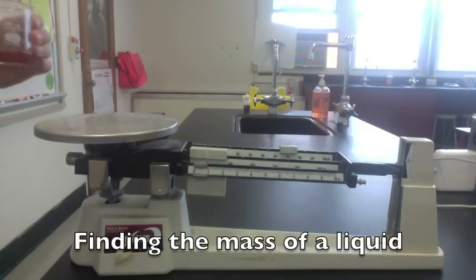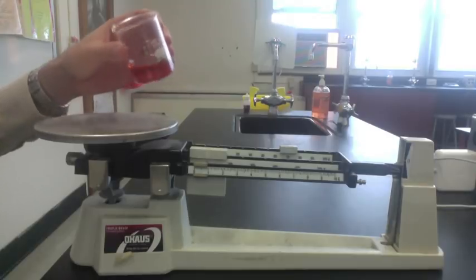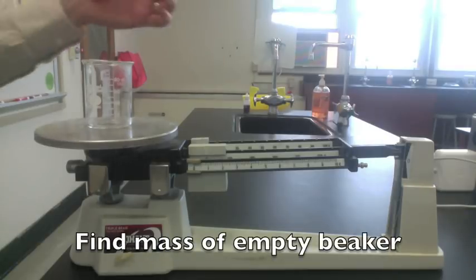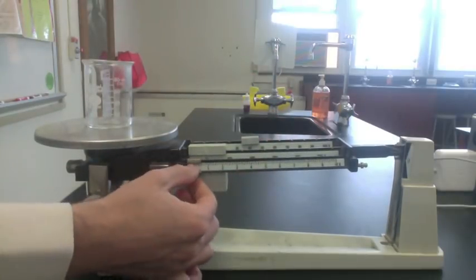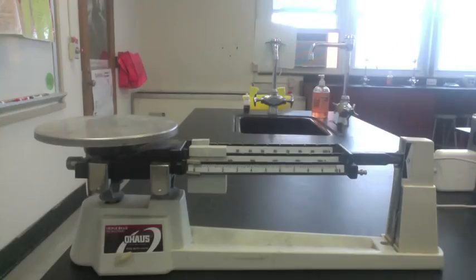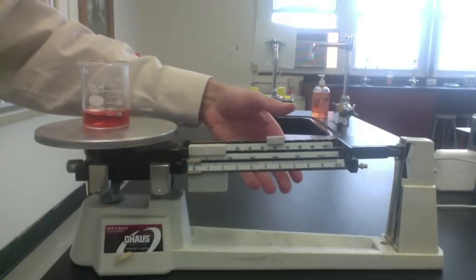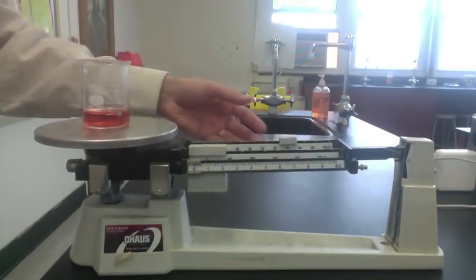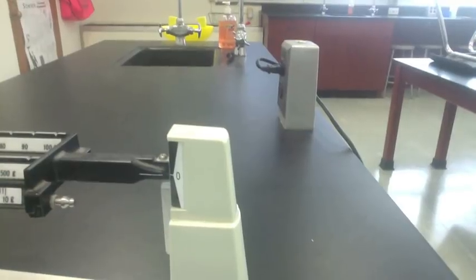When finding the mass of liquid, you cannot just pour liquid on the pan — it'll spill everywhere. You have an extra step to do. With the scale zeroed out, find the mass of an empty beaker. Next, find the mass of the beaker and the water. The last step is to subtract the mass of the beaker from the mass of the liquid and the beaker.